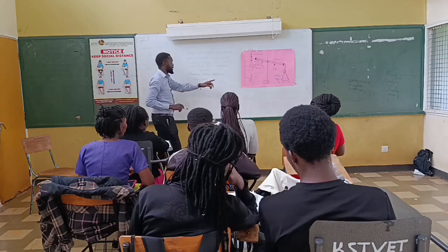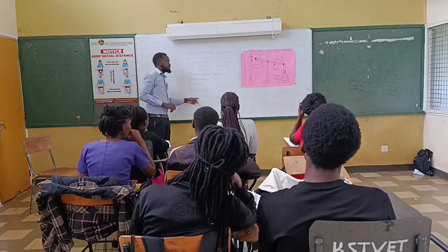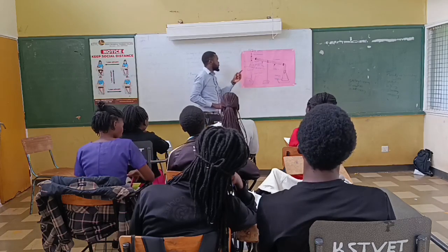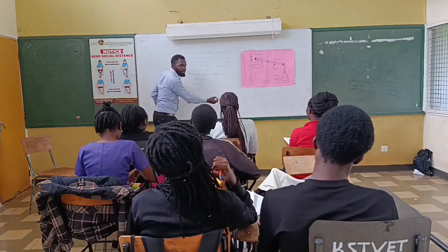The difference between the distilling flask and what was mentioned as a round bottom flask is that it has a shoulder that connects to the condenser. So this is called a distilling flask. A round bottom flask doesn't necessarily have it.